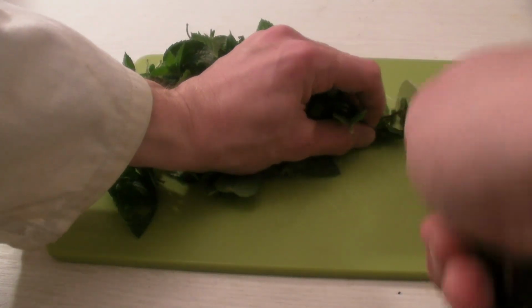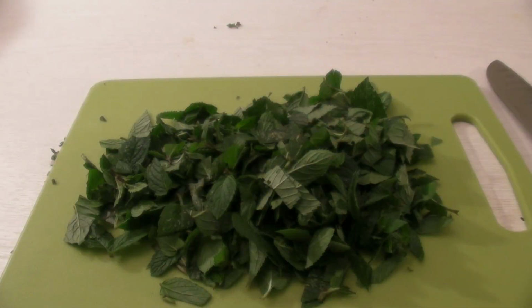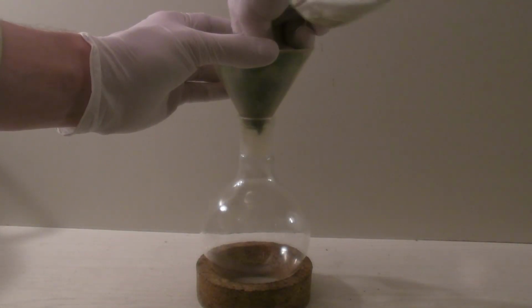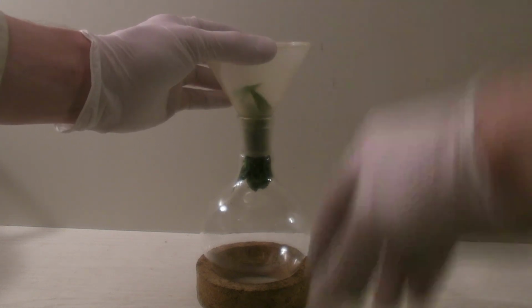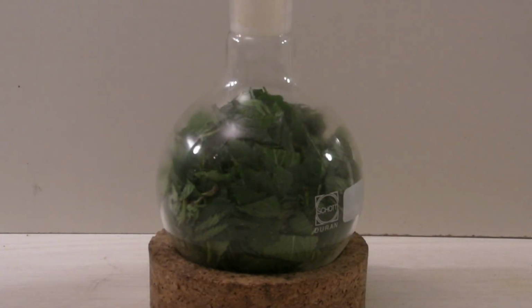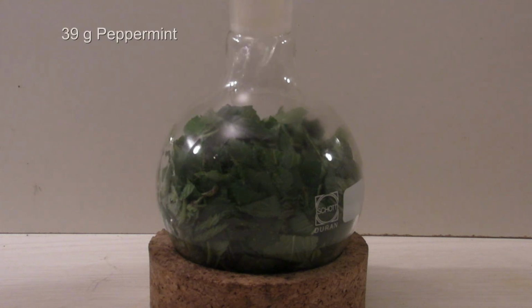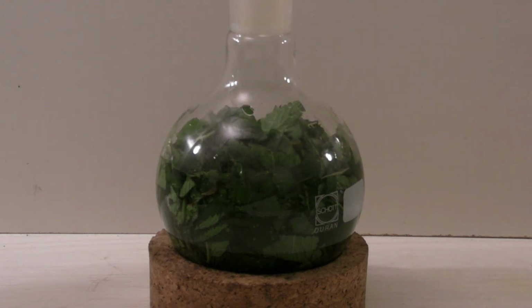For the distillation they are cut roughly in smaller pieces and then added to a round bottom flask, where a larger one would be better. In my case I only had a 500 milliliter flask, but a 1 or 2 liter flask would be better. Quite often a minimum of 5 liters is used. The amount of peppermint was 39 grams. Then the flask was filled up with water to 2/3 of its volume. Usually it is taken care of that the flask is just filled halfway in a steam distillation.